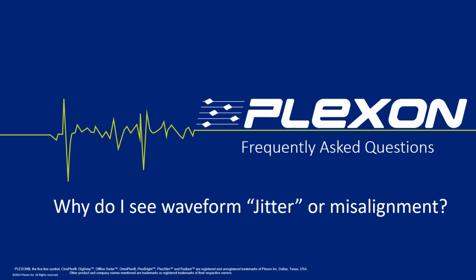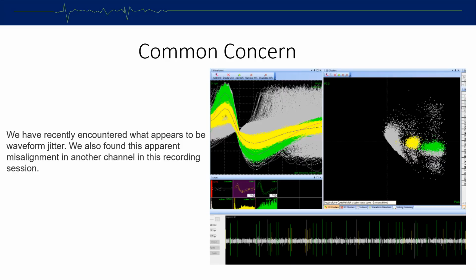We created this video to show how to use Offline Sorter to visualize what is happening and to demonstrate a few things that can cause the misalignment. We will use this example to demonstrate these points.